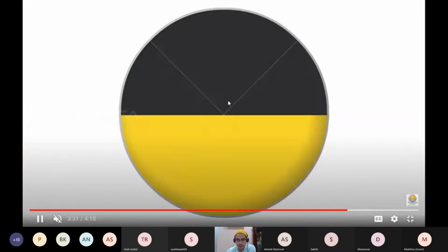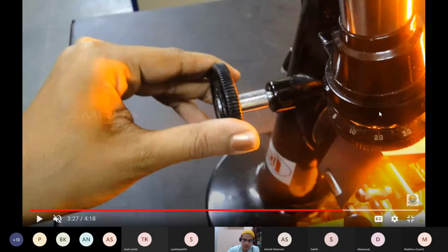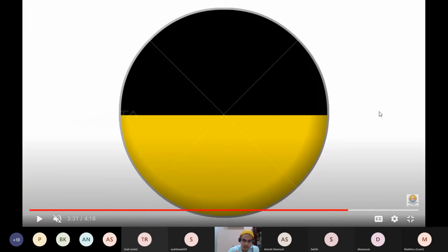So there's a knob on the side of the instrument. This is what we see in the scope. So this is a knob yang kita boleh adjust. So what we need to adjust adalah this thing. Okay, at the top of the refractometer ada macam satu scope. Macam kamu mikroskop, kamu letak mata kamu, kamu boleh tengok. What you see is this.